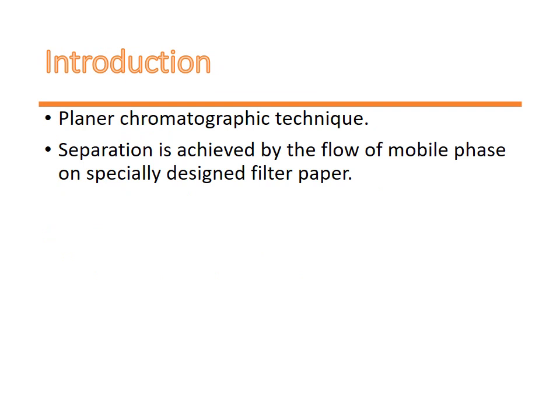Paper chromatography is a planar chromatographic technique. In this, the separation is achieved on a planar surface by the flow of mobile phase on specially designed filter paper.